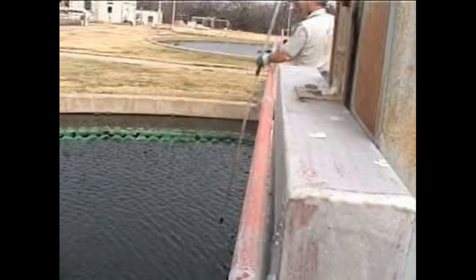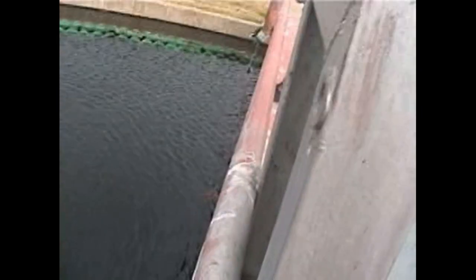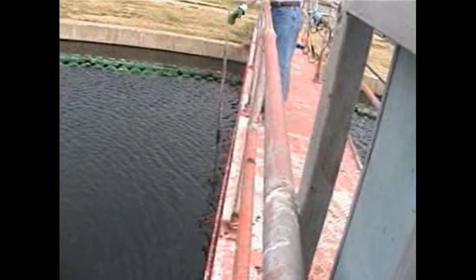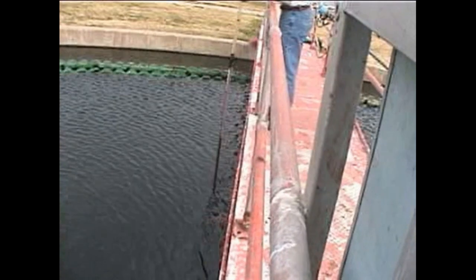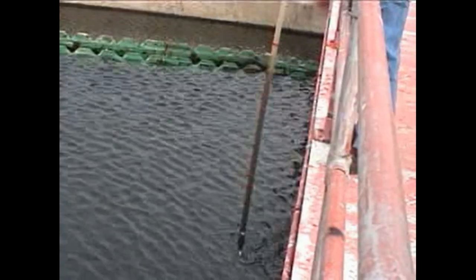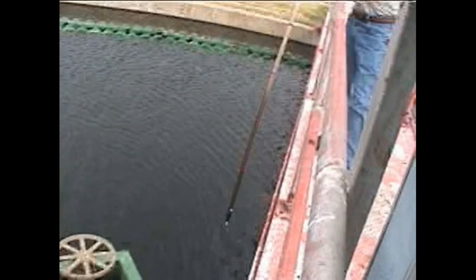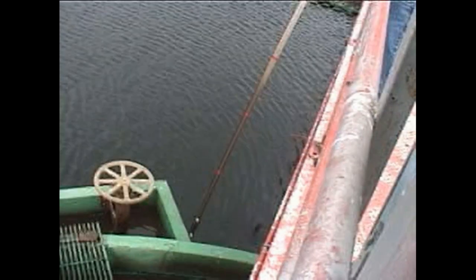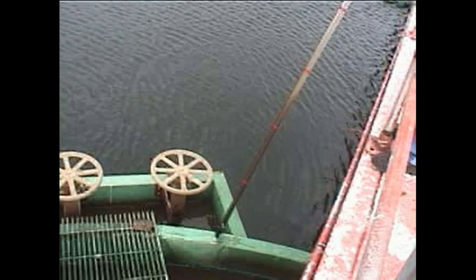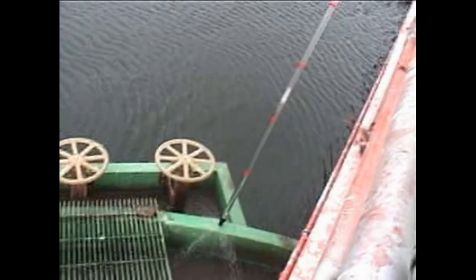So now he's going to go back in very quickly, as if a storm was coming, let's say. He's in a hurry. And he's letting that tube equalize, and now he's bringing it up. And lo and behold, now we have a couple of feet of sludge. As a matter of fact, five different people might call that measurement 2.5 feet, 2.25 feet, 2 feet. So there's some ambiguity in terms of how you read a sludge judge as well, I should say.